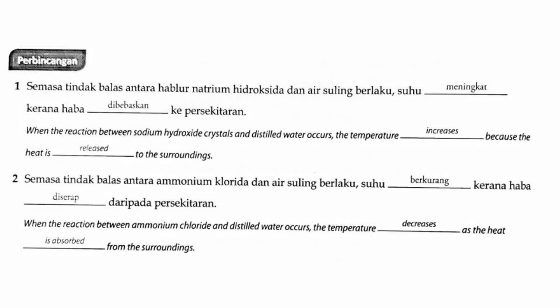Discussion: when the reaction between sodium hydroxide crystals and distilled water occurs, the temperature increases because the heat is released to the surroundings. When the reaction between ammonium chloride and distilled water occurs, the temperature decreases as the heat is absorbed from the surroundings.